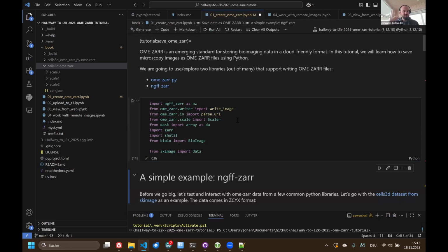So if you're using the other package, ome-zarr-py, you have to generate the metadata upfront in particular objects in a particular structure and then pass this to your image writer function. Which is a different kind of ergonomics. It gives a bit more control on the one hand, but it's a bit less ergonomic or intuitive on the other hand.